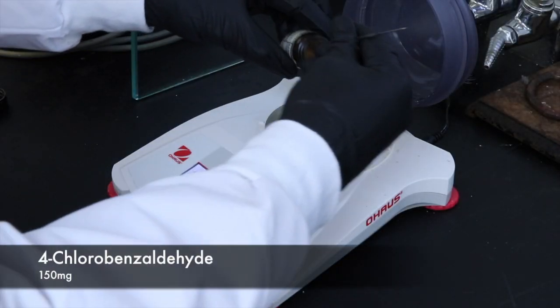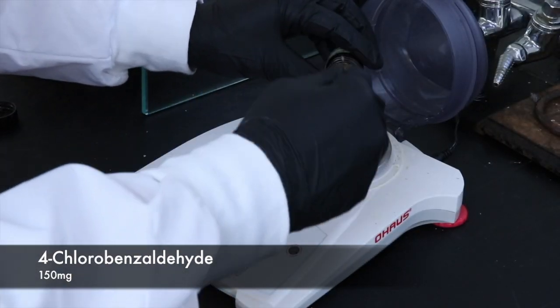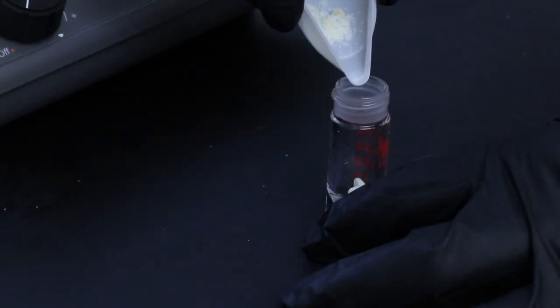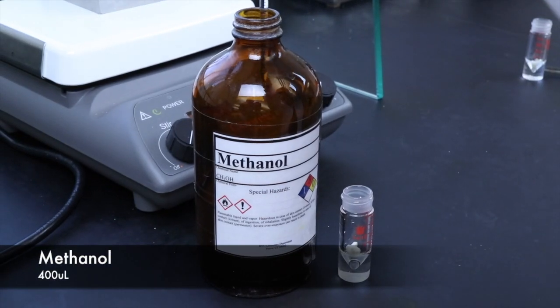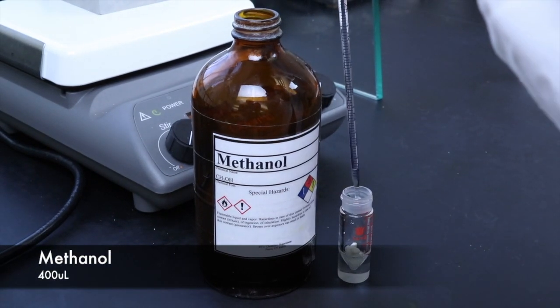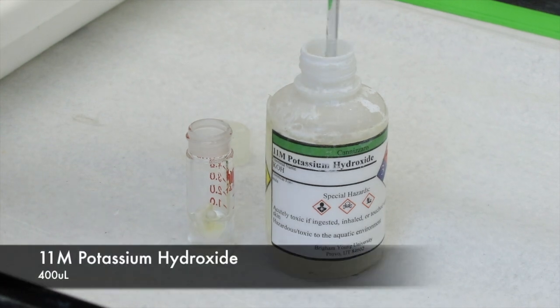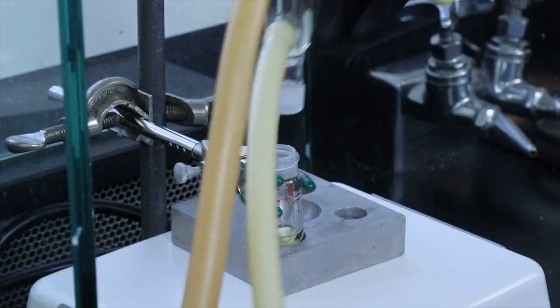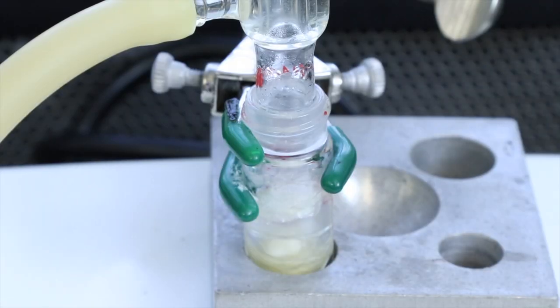Okay, I'll start out by measuring the 150 milligrams of our reagent, the 4-chlorobenzaldehyde. And then I'll go ahead and take that and put it in a 5 milliliter conical vial with a large spin vane. Then I'll be adding 400 microliters of methanol and 400 microliters of the potassium hydroxide. Now I can set up the apparatus and I'll let everything reflux for an hour.